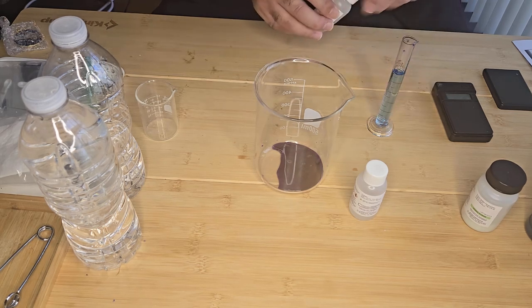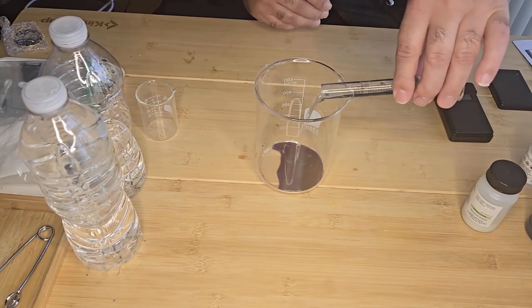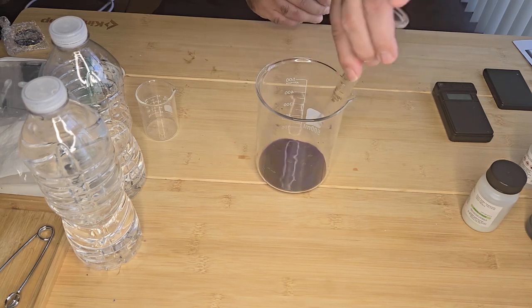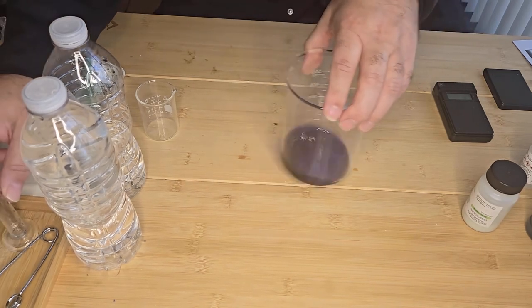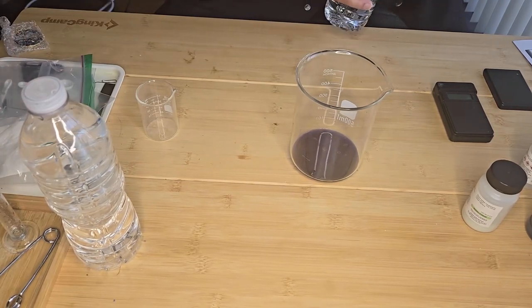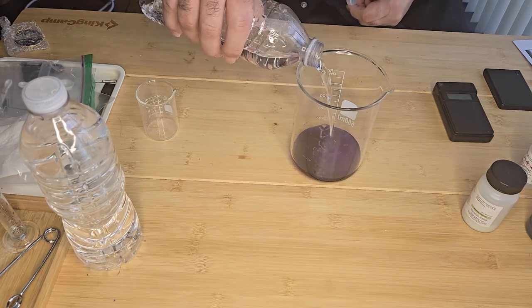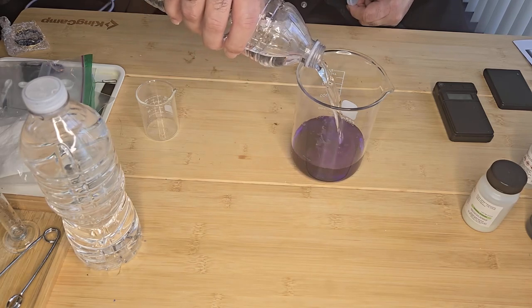I'm going to put that into the beaker. Okay. And then I'm going to add water to take it up to 500 mils.